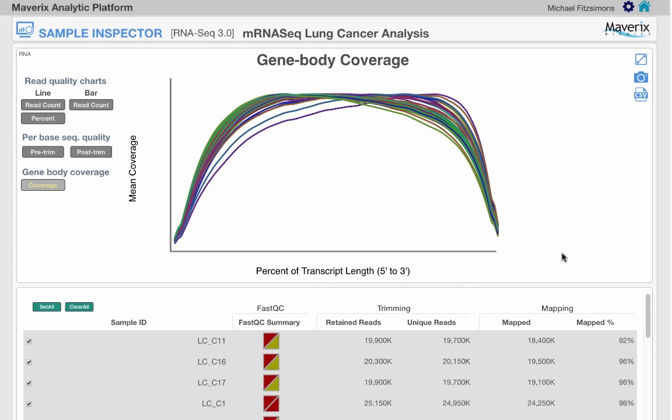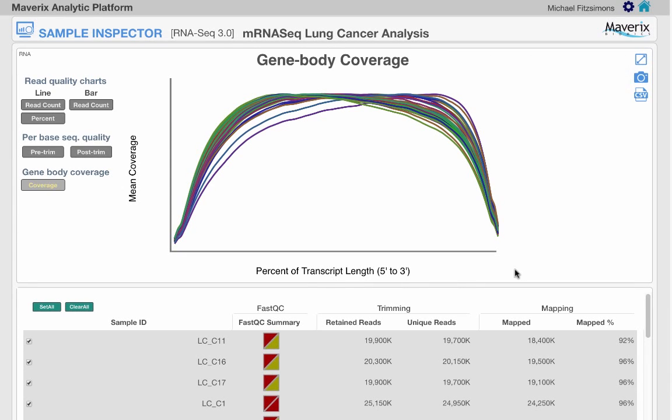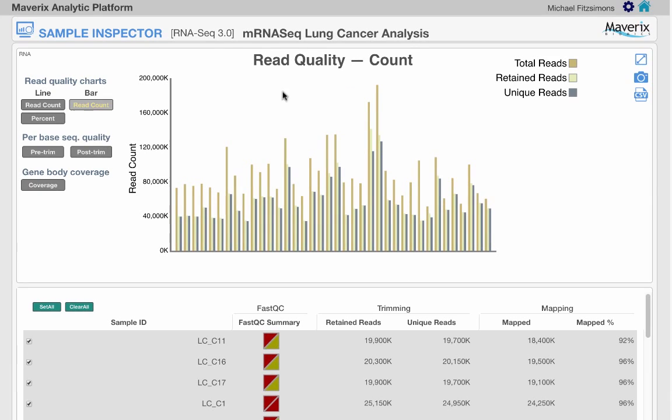Each of these figures can be easily exported. To identify outlier samples, simply mouse over the line or histogram of interest to see the sample name and exact values.